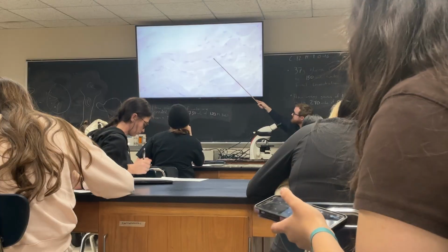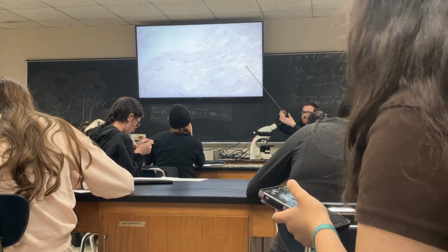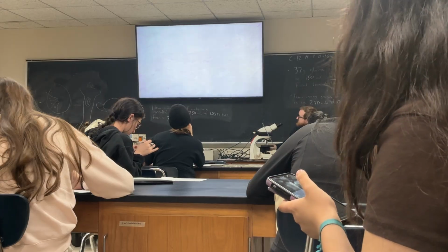This is one cell, a different cell. All those nuclei look like they're in between cells because they're all squished to the sides of it. I still don't see any striations.